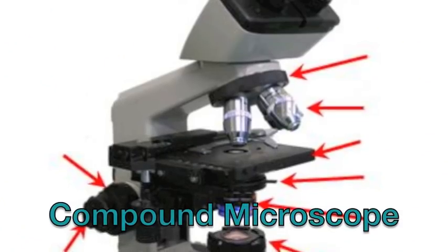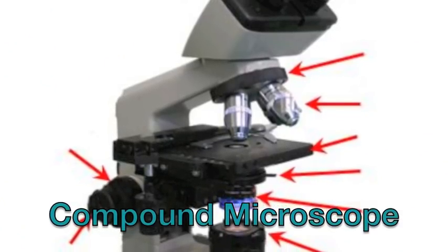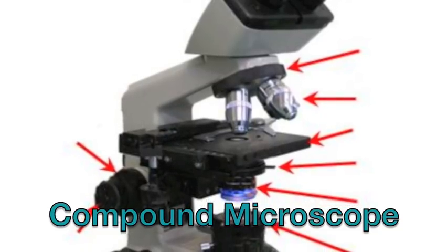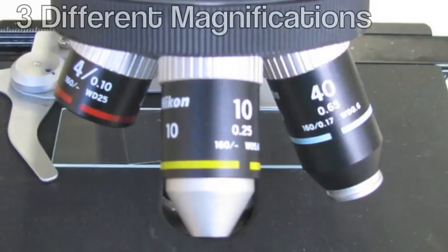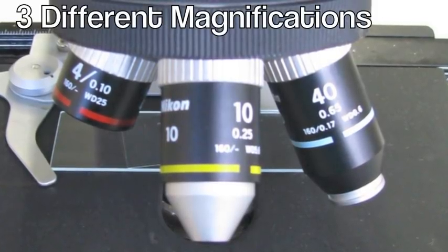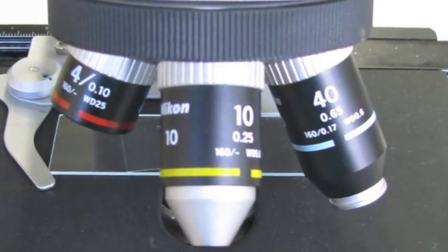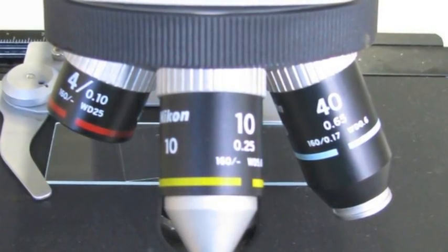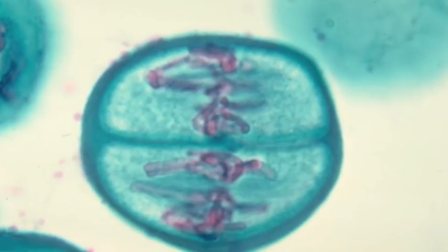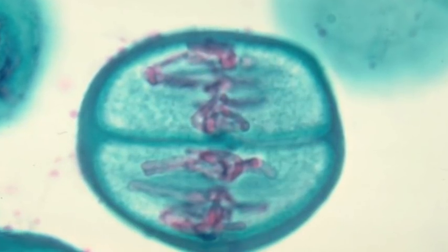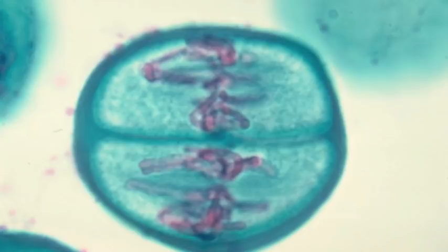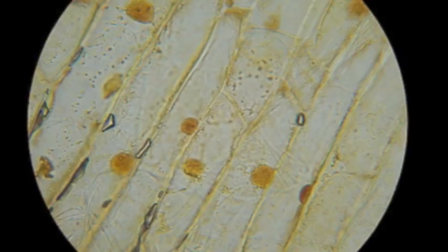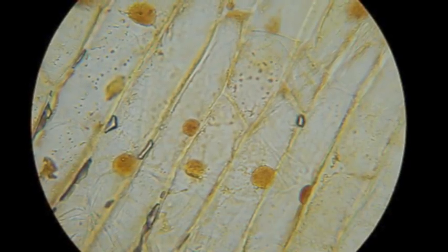This is a compound microscope. We will use these to help us see individual cells. The compound microscope has three different magnification levels, which will produce 2D flat images. They help us see parts of a cell, such as chromosomes and nuclei.